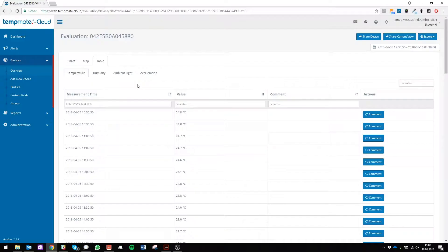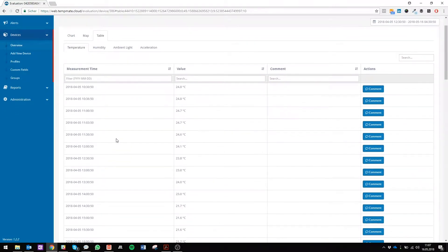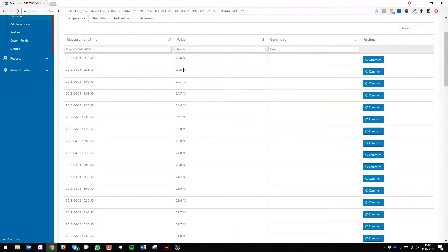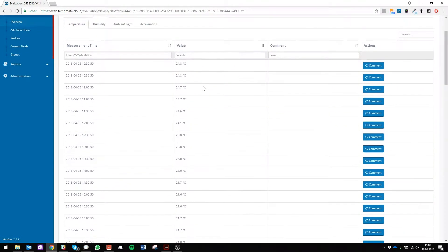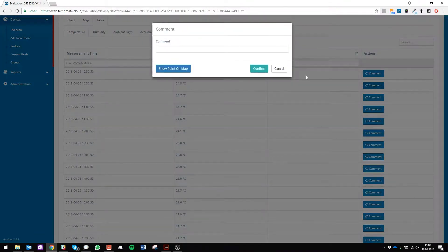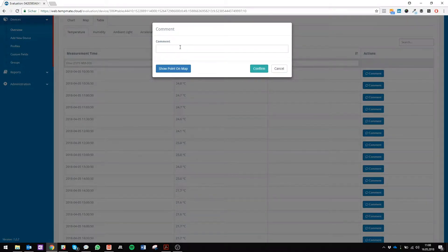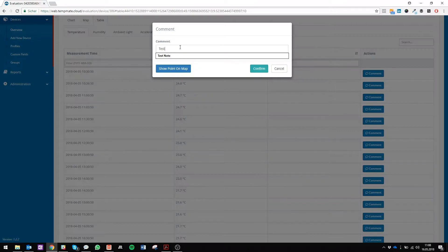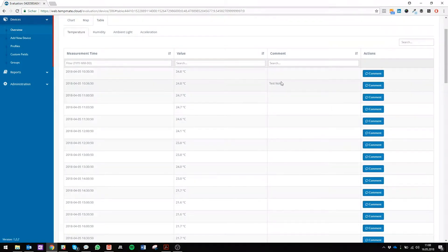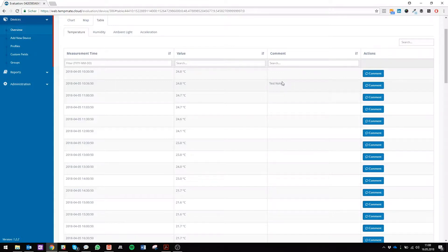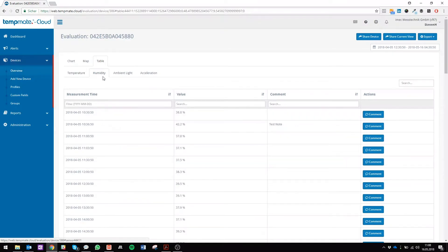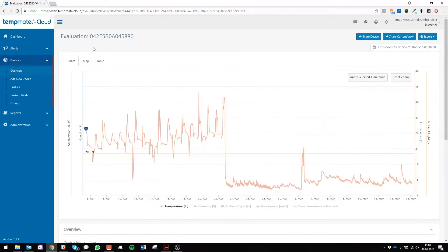Now you see it in the comment section, so everyone who is working with the TempMate cloud can see the test note. You can switch to humidity and it shows you the same thing with the test note.